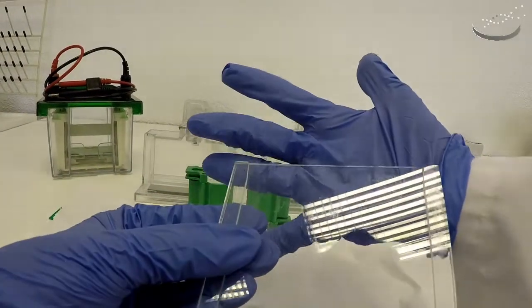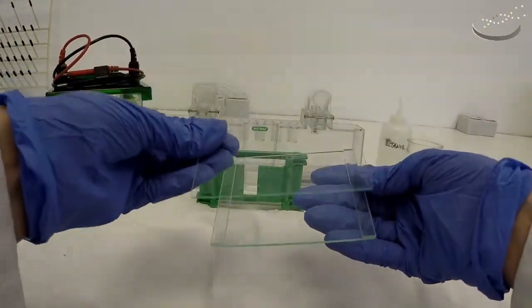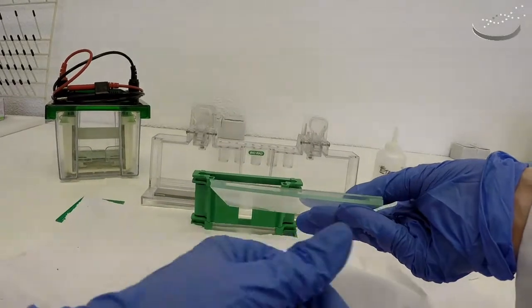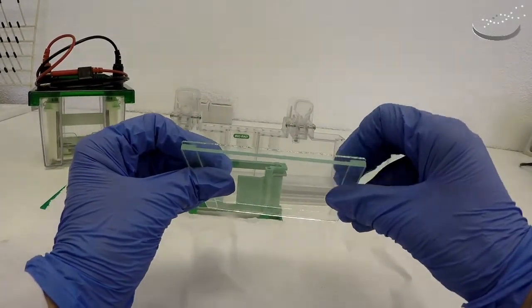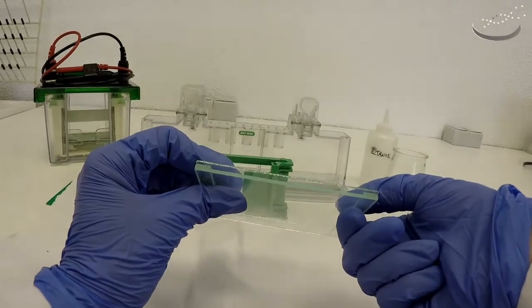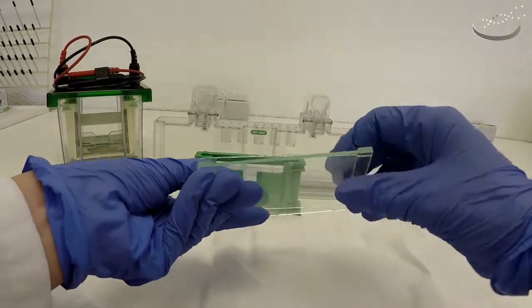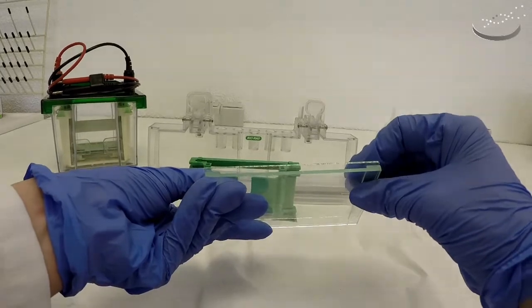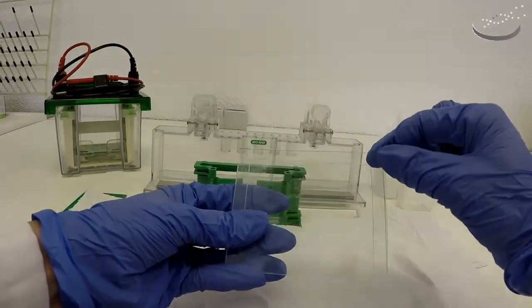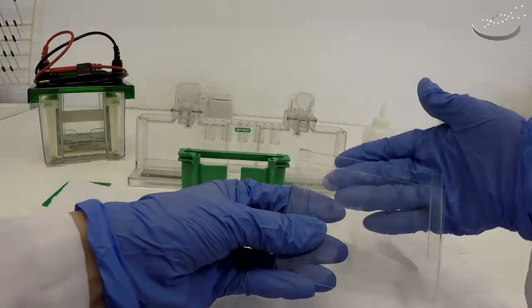You always want to make your gel in that orientation. What we're going to do is place the small plate on top of the large plate, and in this way we're going to create a chamber. You can see where the spacers are — when we put the small plate on top, you get this space in between the two plates. This is the chamber where the gel will polymerize. If we look on the top side and turn it around, we'll see that the short plate is shorter than the long plate. We're going to create this space where we'll introduce the liquid gel to polymerize and also load samples once the gel is polymerized.